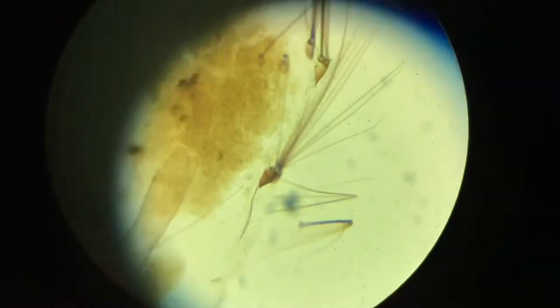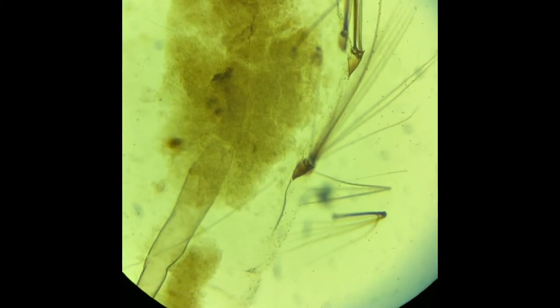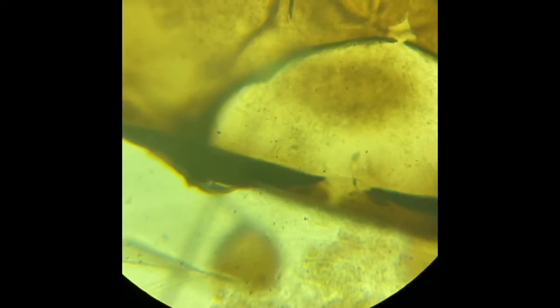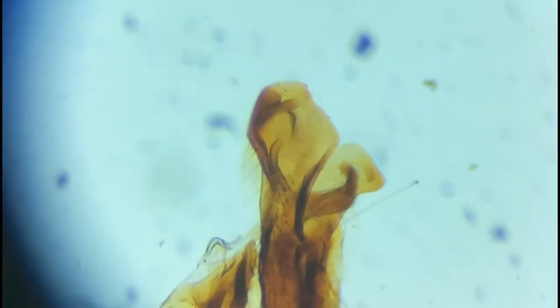Here it is — let me put my phone up to the camera as if you were looking through it with your eye. You'll have to play around with the focus a little bit, but this is basically what you can expect. My criteria was amazing clarity, and this is at the lowest setting. We can slowly zoom in and rotate to the next more powerful lens — and we are looking really, really good. I think this is the end of a honeybee wing.